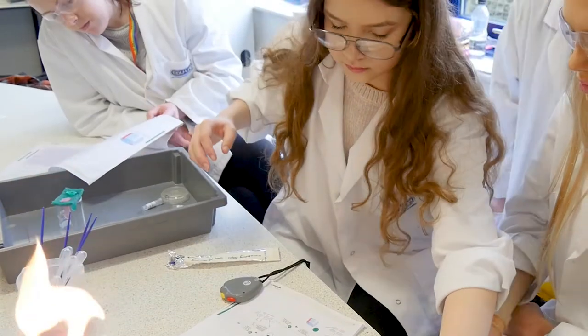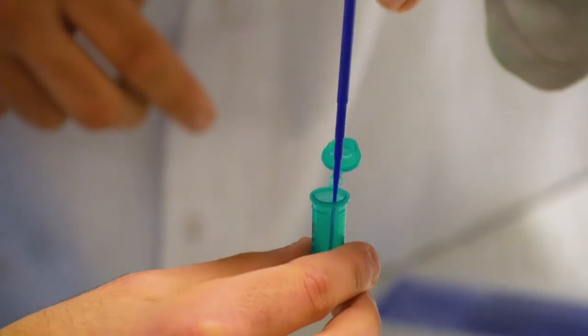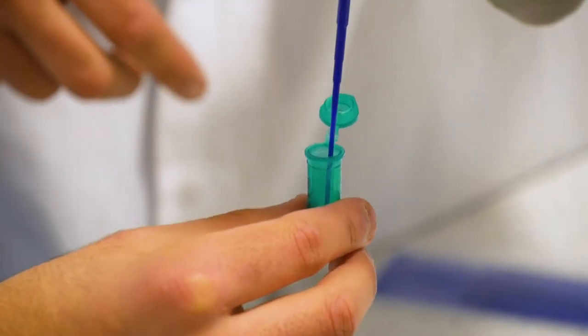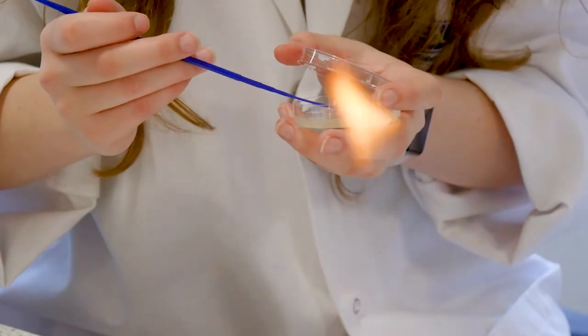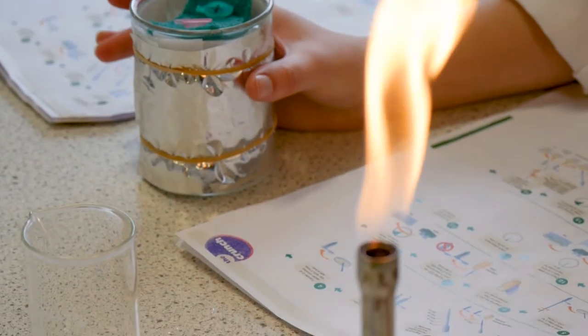One of the things that the students need to look at is essentially the use of genetic technologies in science, and this particular practical involves the use of a gene known as PGLO because it fluoresces under UV light.